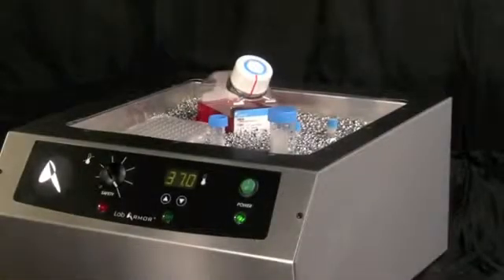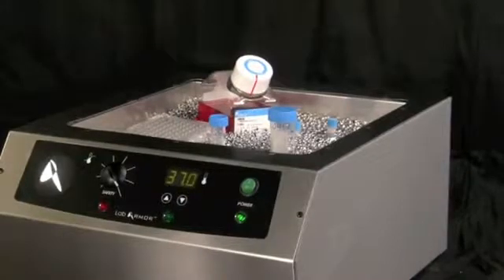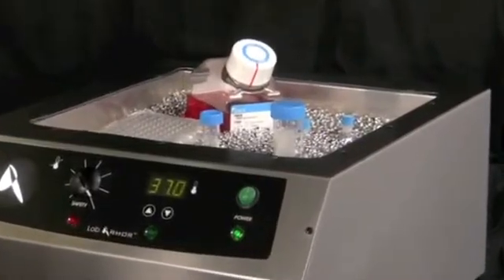Beads can support most types of vessels without racks or bottleneck weights, including non-water tight plates. For samples that require agitation, simply place a tray of beads on a standard laboratory rotator inside a general use incubator.